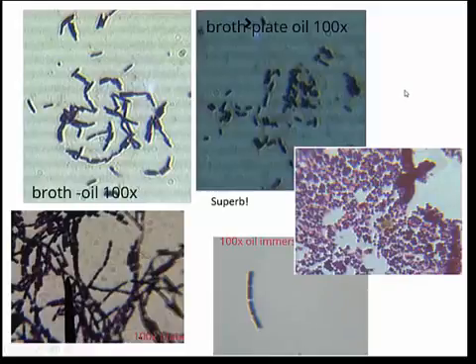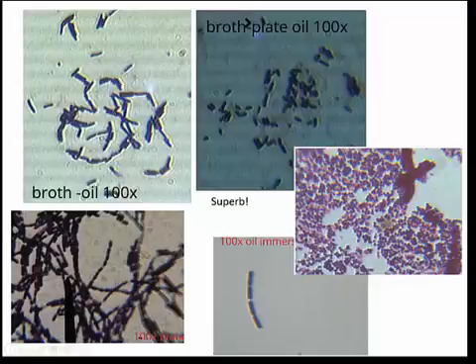This really excites me. I'm so happy when students can produce high quality images like this. So look at this. This right here is a bacterial cell. This is another one. So this would be diplobacillus. This would be just bacillus. When we've got a chain of them, that would be streptobacillus. So these individual cell, individual cell, individual cell, etc.